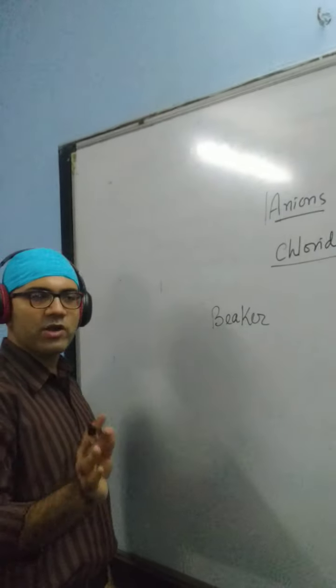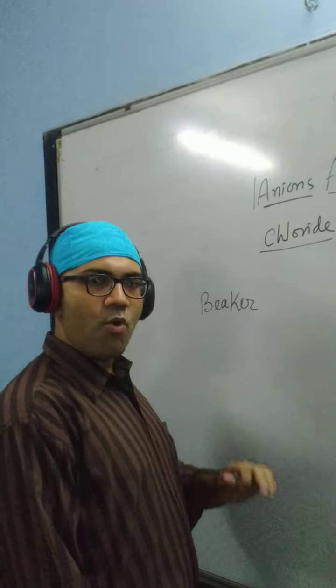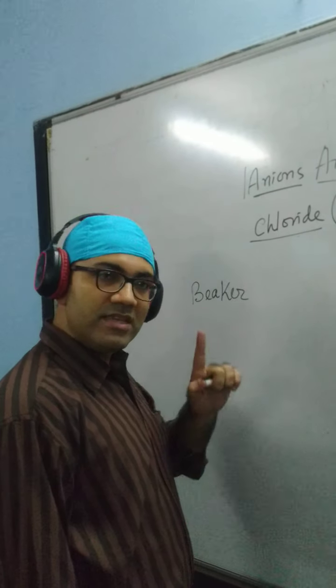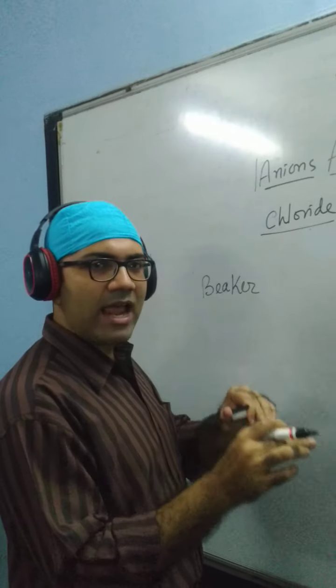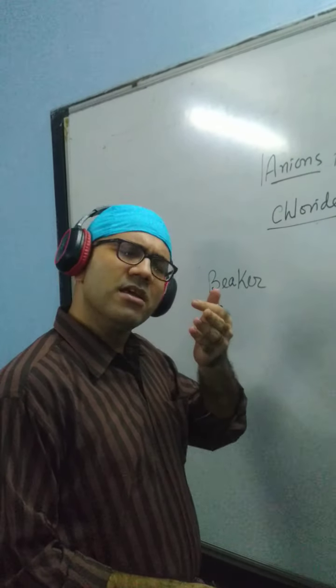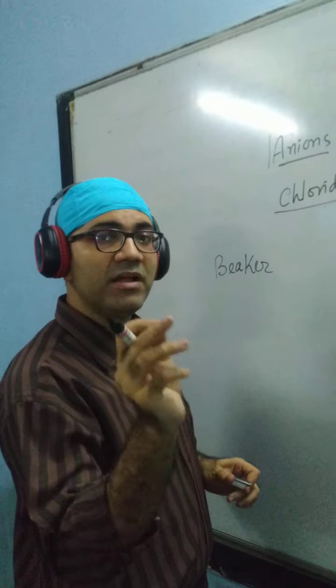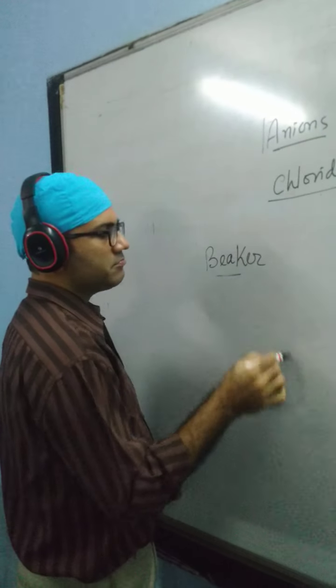OS is not so much compulsory, but this is compulsory in most of the anion analysis. There are one or two where you can do it with OS, but sodium carbonate extract is compulsory.